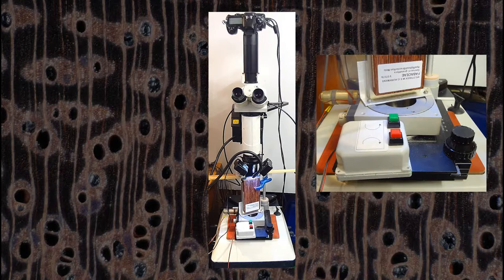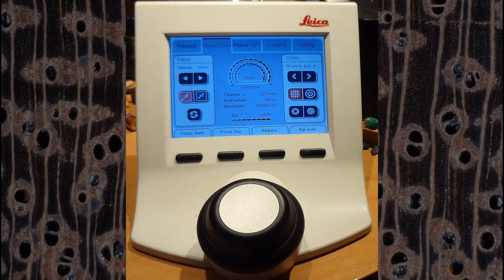Finally the fifth part is the console that lets you control the macro zoom.